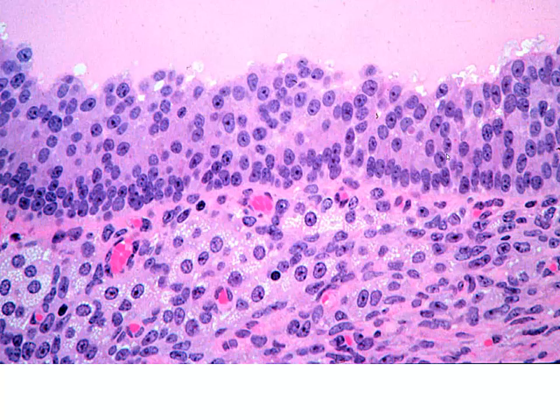Now, as we begin to look at the cells of the periphery, here we have our antrum filled with liquor folliculi, our granulosal cells. These are going to be our theca interna cells, and you can see the number of red blood cells in here. This is highly vascular. You can see the vesicles of the secretory nature of the theca interna cells, and then we've got our stromal type theca externa present on the periphery here.